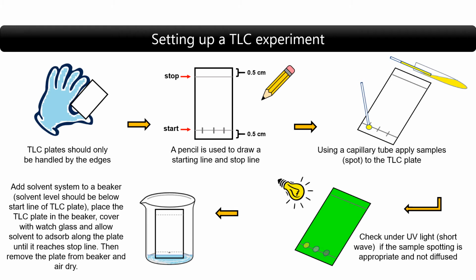But if the solvent was already above the starting line, then the compound that was spotted on the plate would just dissolve into the solvent and we won't be able to achieve an appropriate separation.